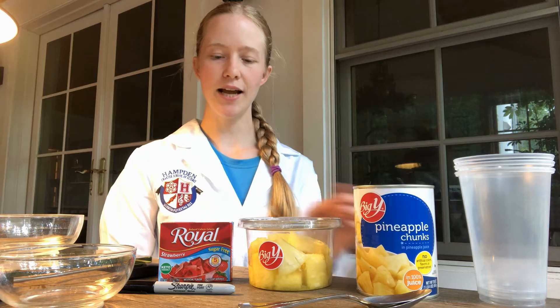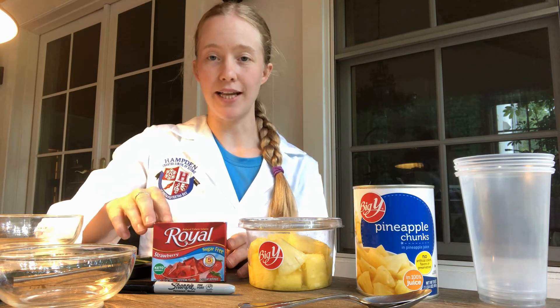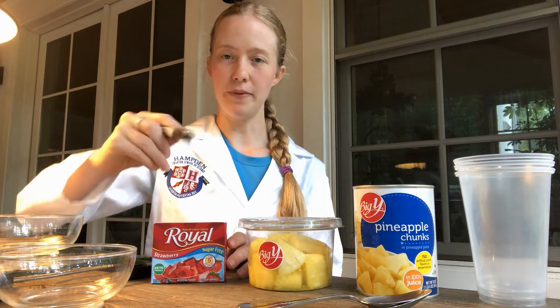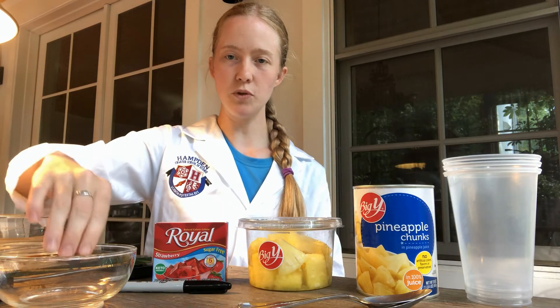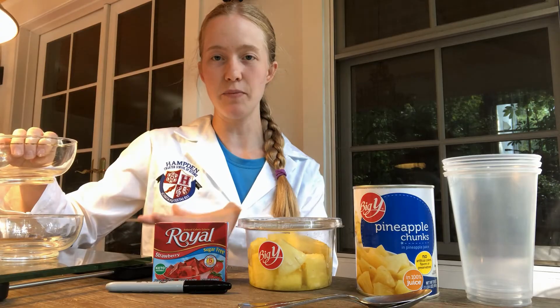For my lab supplies you can see I have two different types of pineapple — fresh pineapple and canned pineapple. I also have gelatin; for this lab you can use any brand of gelatin. Gelatin is essentially a protein. I also have a sharpie to label my cups, bowls and spoons for measuring the pineapple, and a balance so I can get the same amount of each type of pineapple.